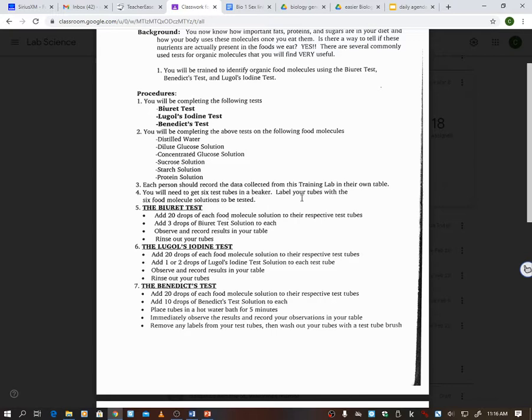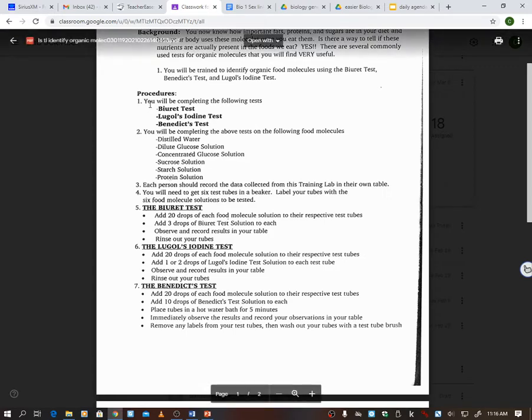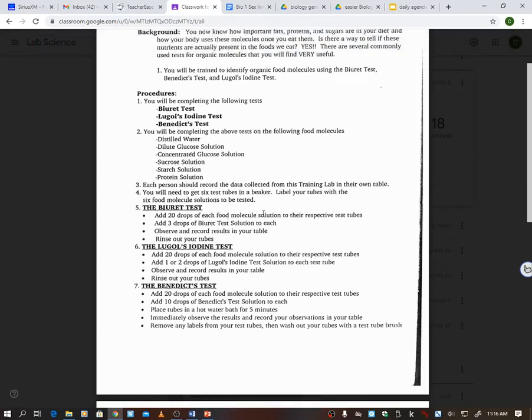So I'm going to present you with pictures. If you can't make it into class, if you want to come in and do this, please come in and do it. That's definitely okay to do. But if you can't, I'm going to present pictures of each of these 6 things in the Biuret test, each of these 6 things in the Lugol's test, all right? So that you can see this, and you'll have to fill in your own table. So today we're going to make that table to make sure that it's ready to go tomorrow.